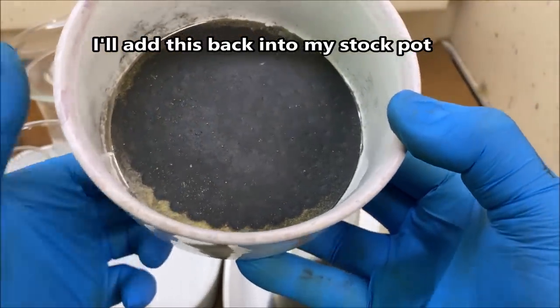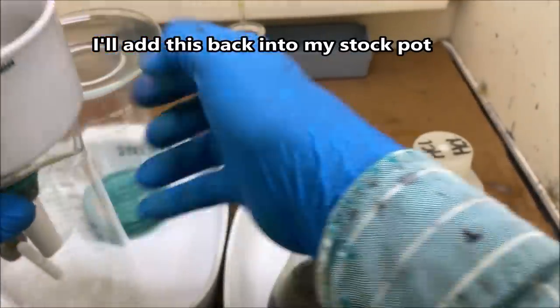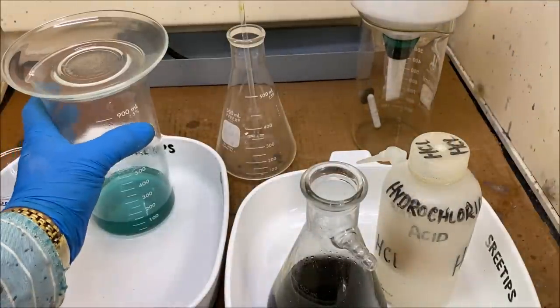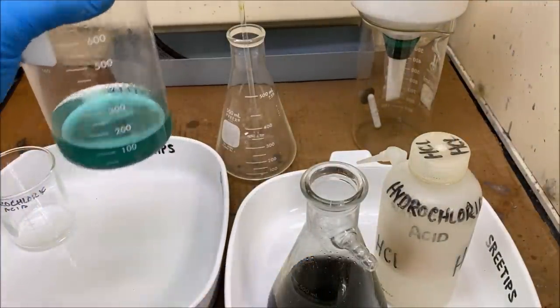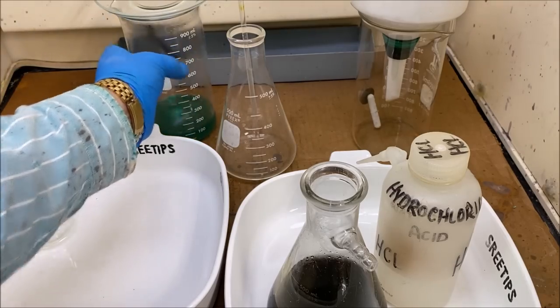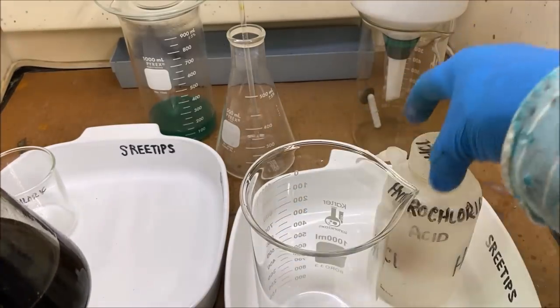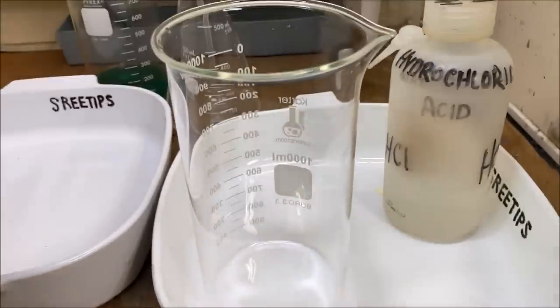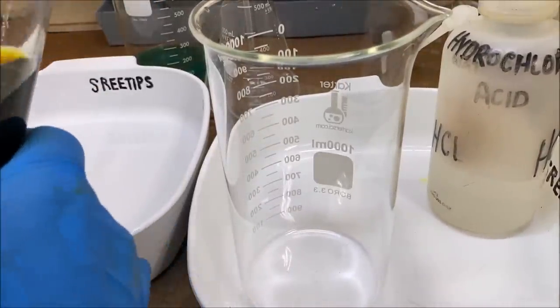That's some kind of platinum group metal in there. I'll set this back out of the way now. This waste solution right here, this copper, it's going to have a little bit of PGMs in it. We'll put that in our stock pot. Now what I'm going to do is pull this up. We're going to put the solution that we just filtered here into a clean beaker.